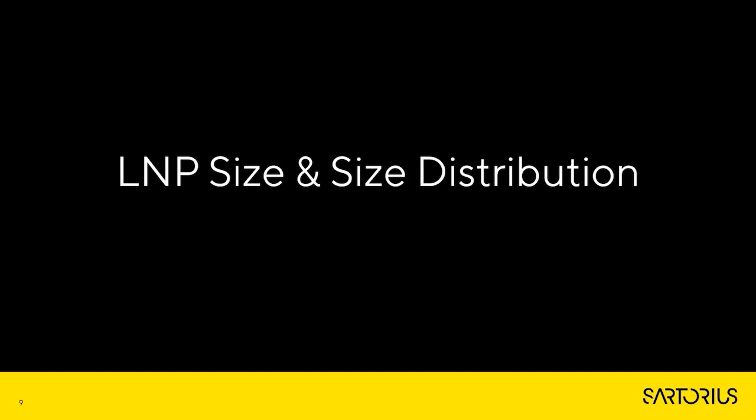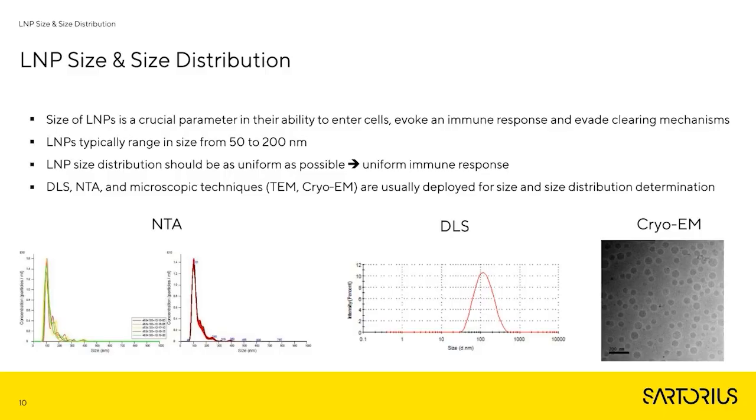Then in terms of multi-angle light scattering and particle size and its integrity, we have different methods that can be applied. Here we have, for example, NTA, DLS, cryo-TEM. Some of them, like cryo-TEM, are very powerful, but they are very laborious and hard to implement as a critical quality attribute, and also not very quantifiable.